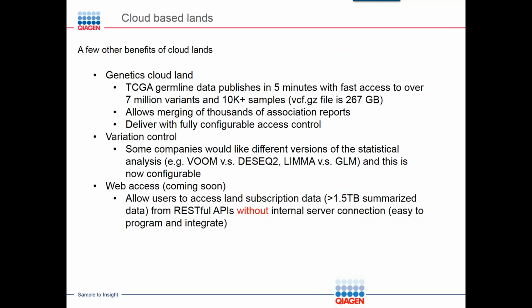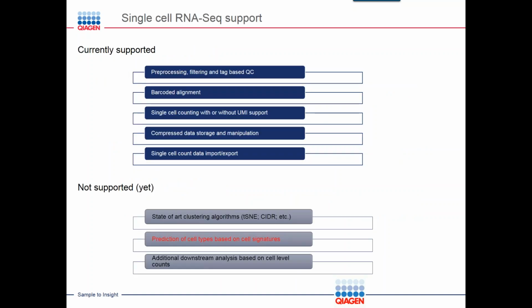Omicsoft point of view. A lot of you already have some ideas from Gary's webinar, but I want to reemphasize that this new technology plus the optimization that we did on 10.0 is going to change the user experience. And this is why I think this is the top feature from the new release.